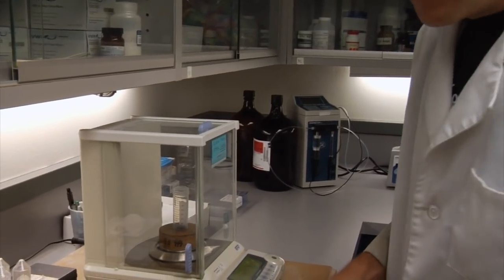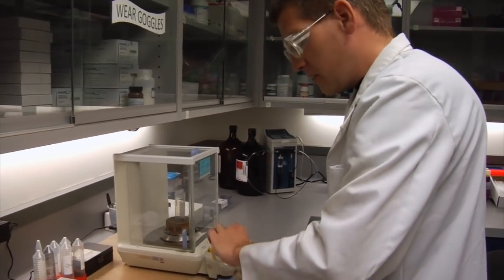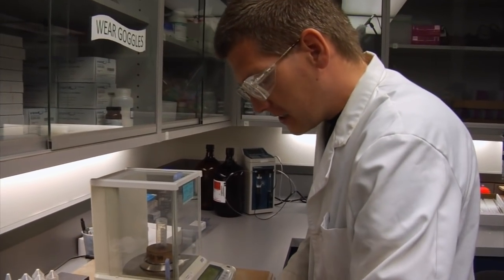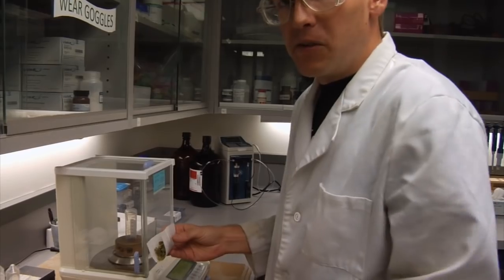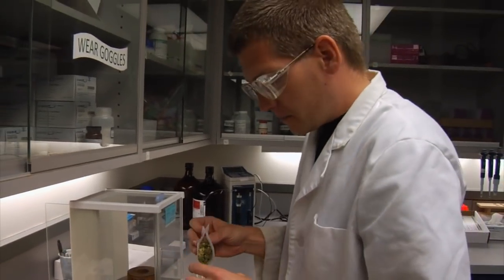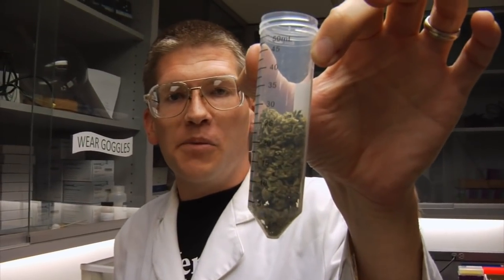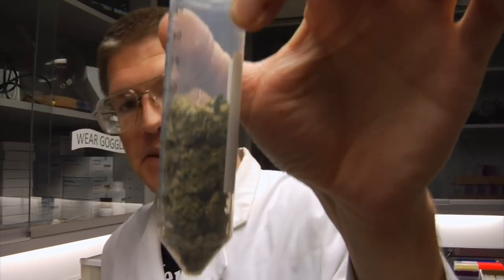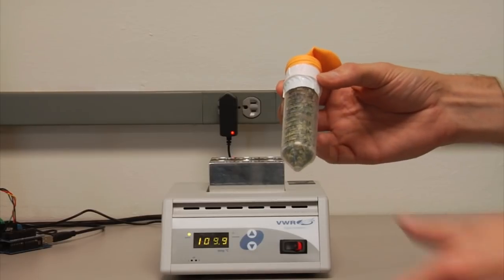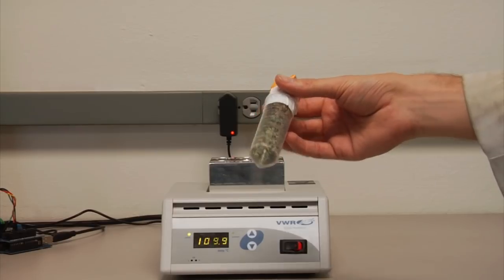I'm weighing some cannabis in these test tubes now. We're going to put a balloon on one of these test tubes to show that when THC decarboxylates, CO2 forms because the THC acid releases CO2 and turns into THC, which is the psychoactive component in cannabis. Here we have a test tube filled with cannabis with a balloon on top, and we'll show that CO2 forms when it gets heated.